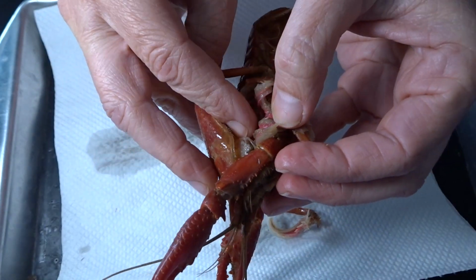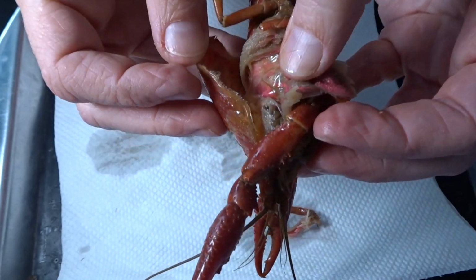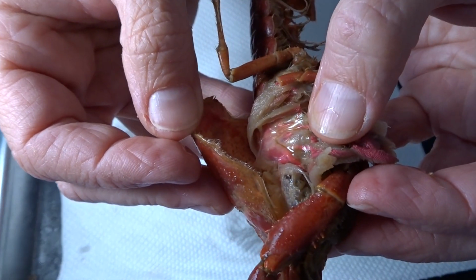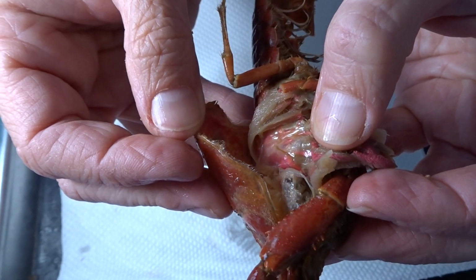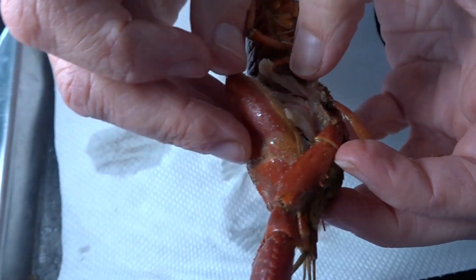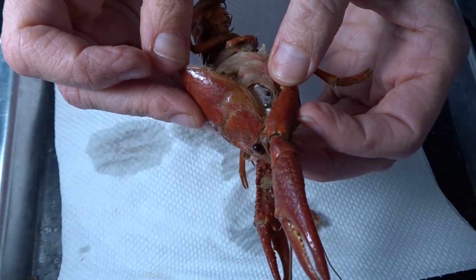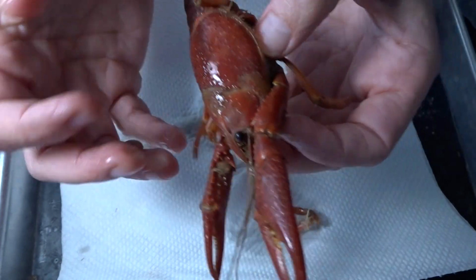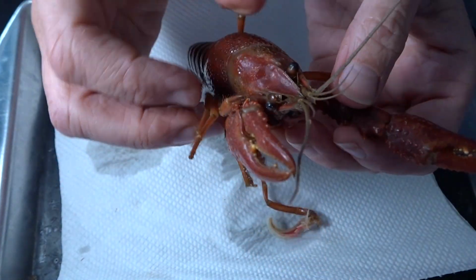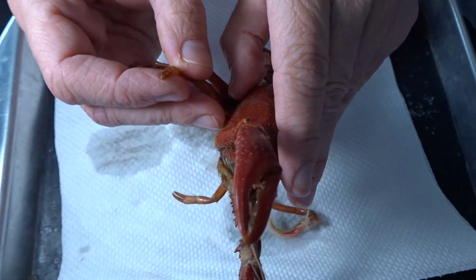you see there's a clear plastic that separates the gill chamber from the rest of the body. Okay, and that's called the gill chamber. All right, so those are all the gills. The gills are attached to each walking leg, and they have a free range of motion whenever the crab or crayfish is walking, and that's how it extracts the oxygen out of the water.